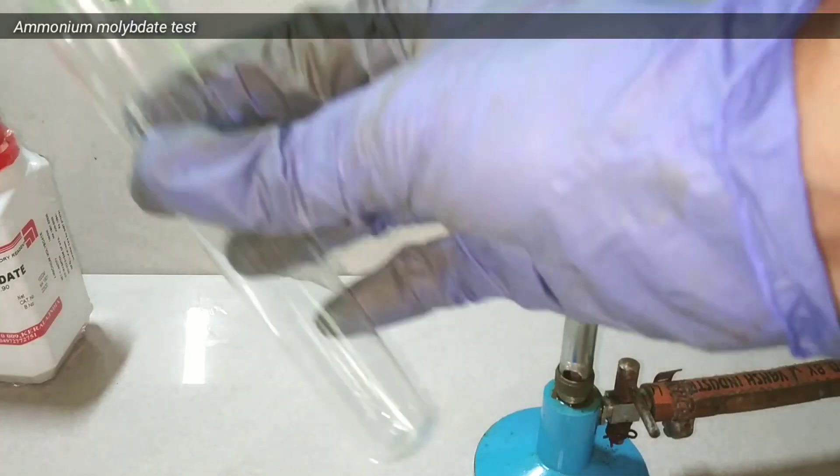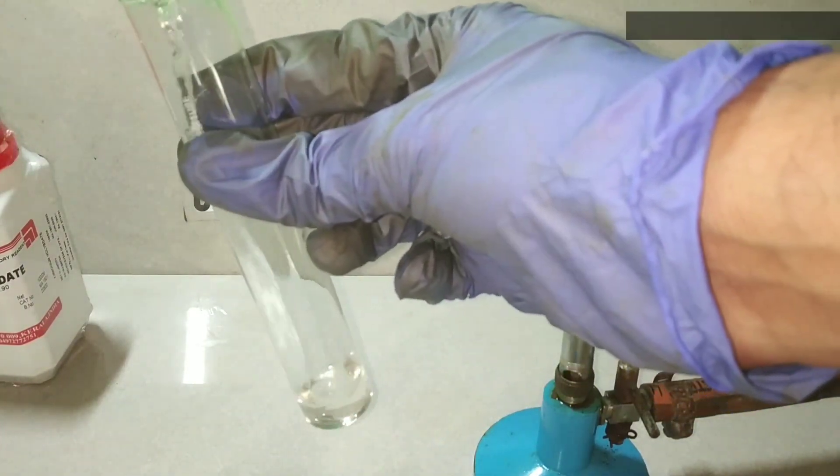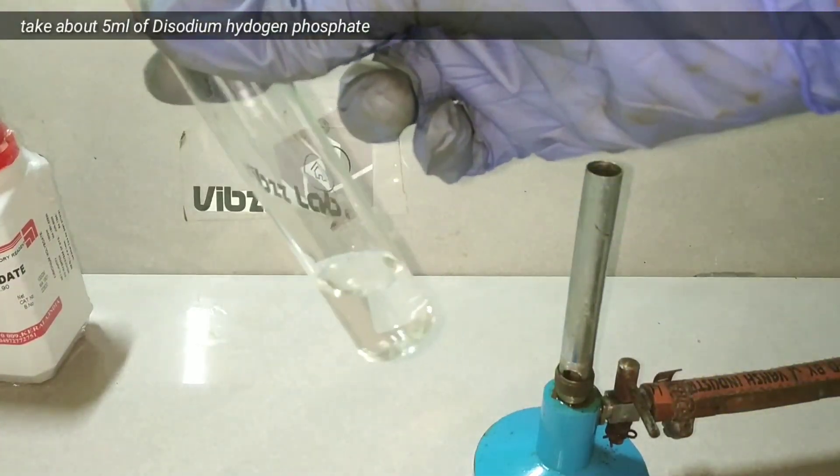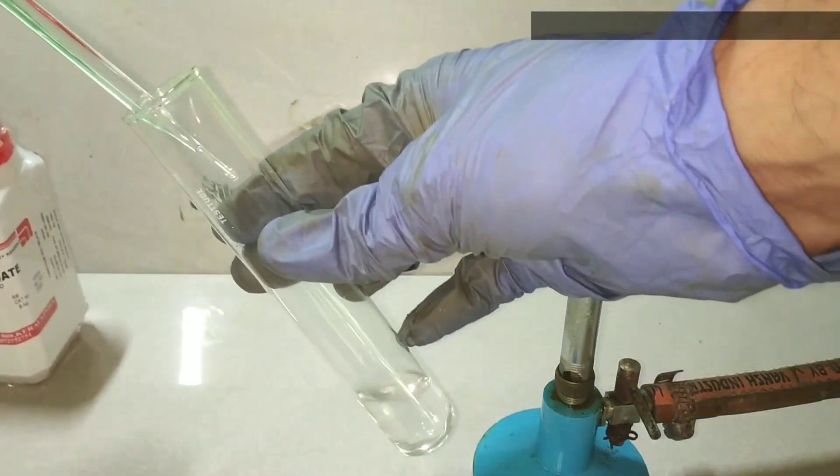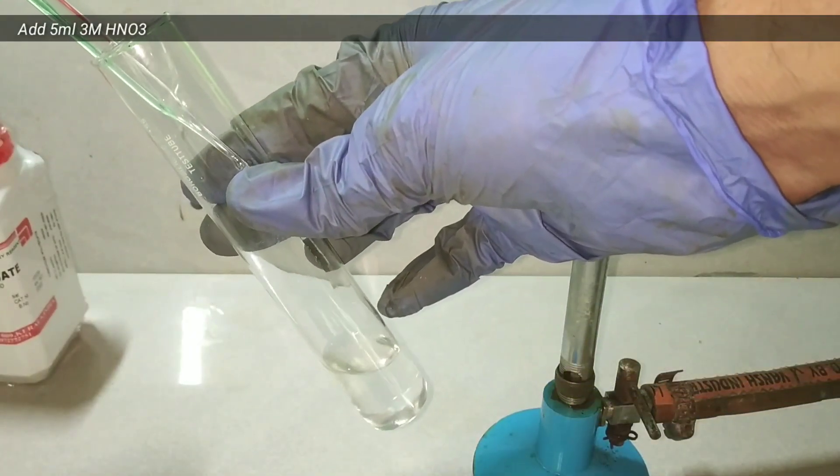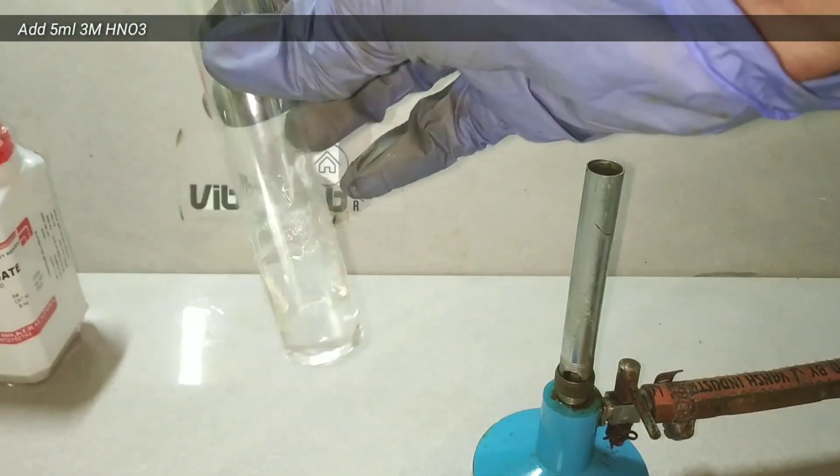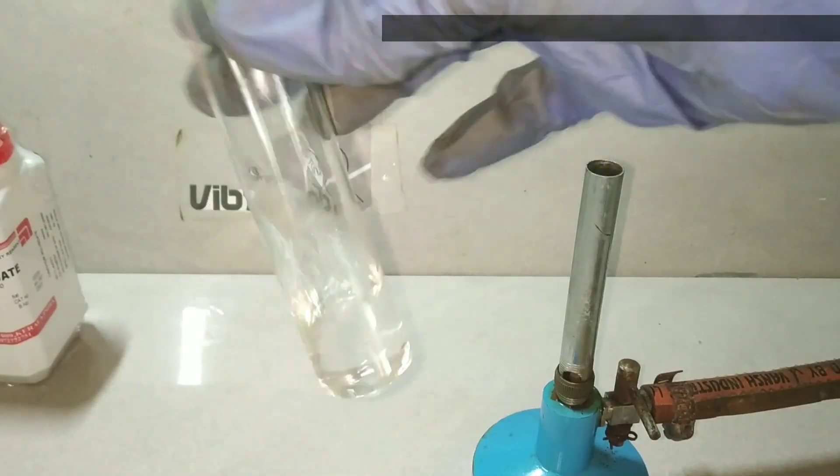Next, we do the chemical test for phosphate. For that, we take some solution of disodium hydrogen phosphate in a test tube, and into that we add 5 milliliters of 3 molar nitric acid and mix well.